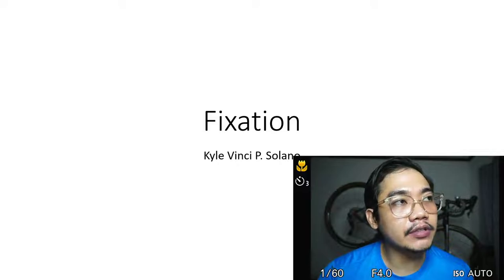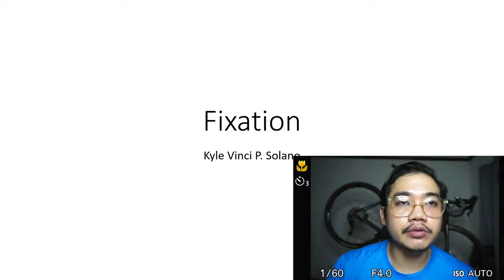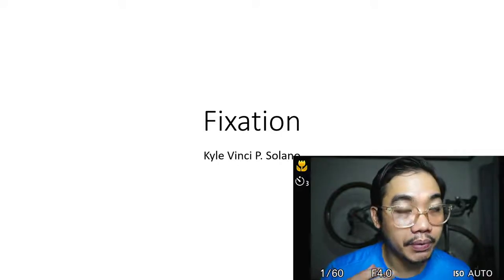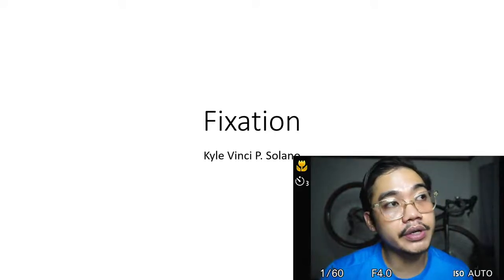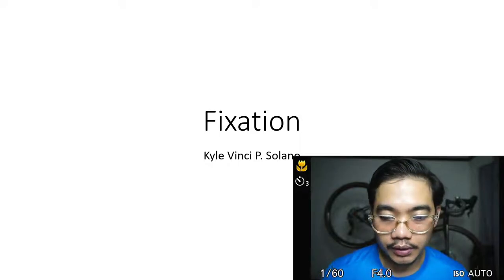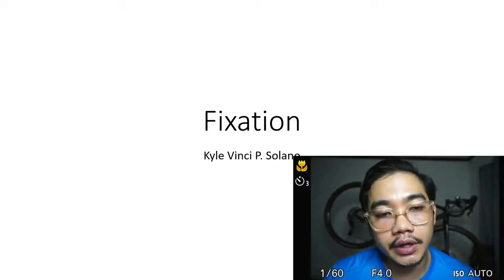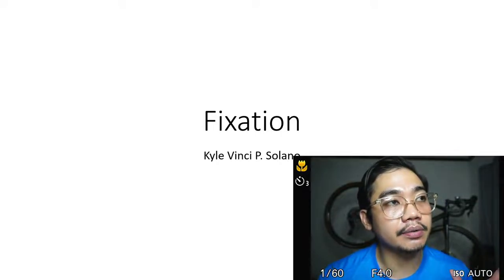Fixation is the first step in our histopathologic process, in which we eventually produce a hematoxylin and eosin slide, which the pathologist will read, and based on the reading, the pathologist will give a diagnosis. And always remember, the first step is always the hardest because there are a lot of things that can go wrong.